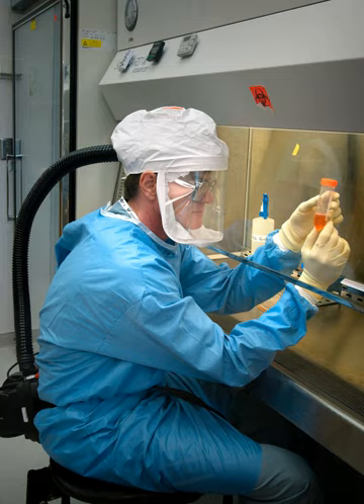Biosafety cabinets are used on a daily basis for hours. Besides protection of user and sample material, the human design factors of the work become more and more important. This includes reduction of the noise level for a more convenient working atmosphere, a height-adjustable stand or stool for optimized sitting position, panorama side windows for more light within the cabinet, and a 10-degree angled front sash enabling better sitting position, as well as strong light sources for a better view within the cabinet.